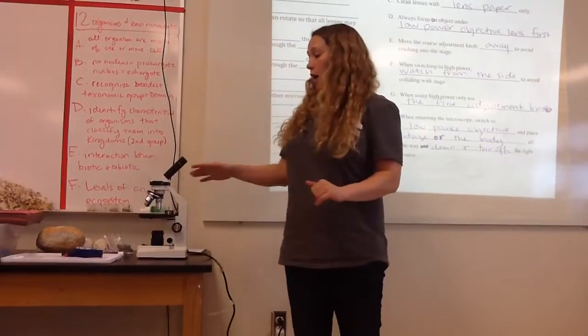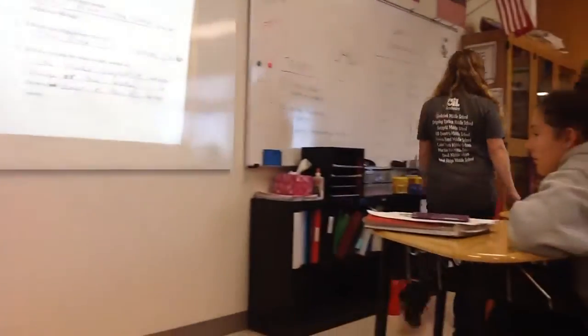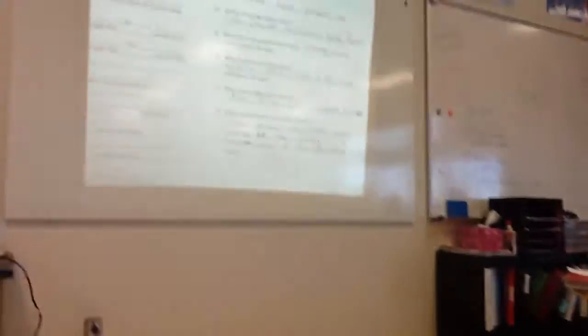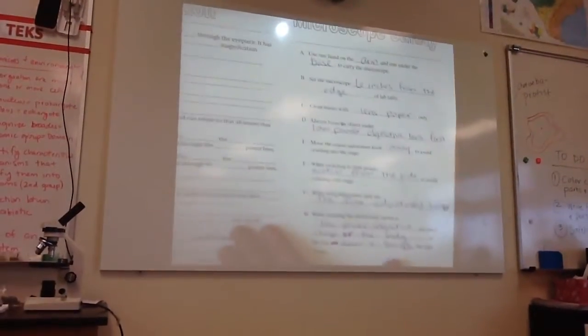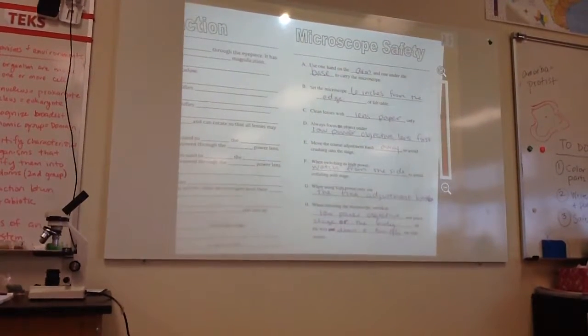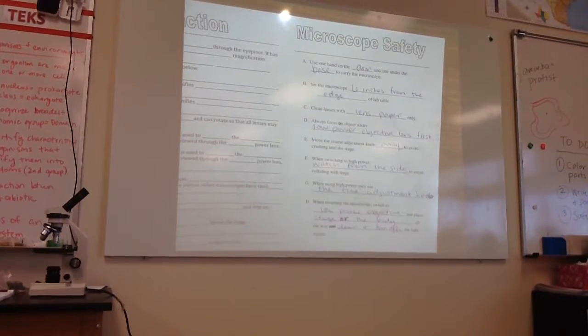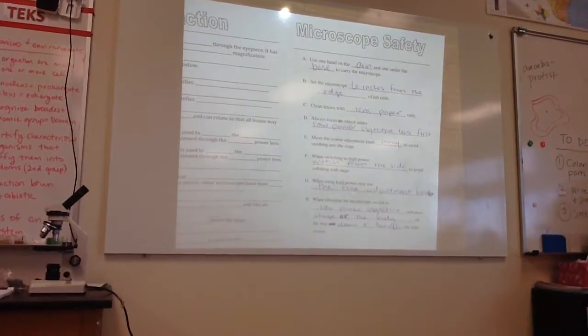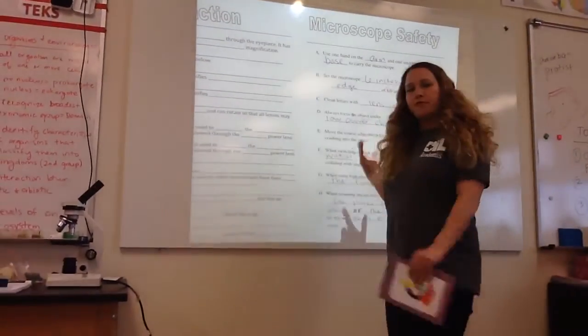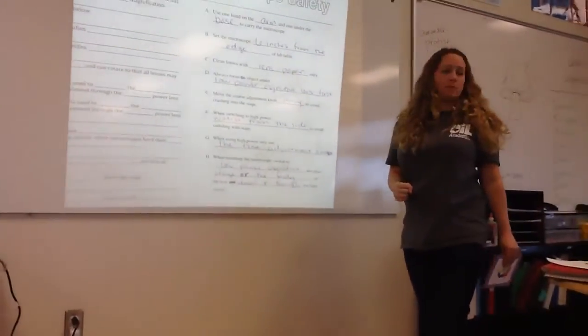Okay? So, I have put on the board the safety for this unit. I'm going to make it more in view for you. Let me get that ready. Back it up just a smidge. There you go. All right, so students, you can fill out your microscope safety information as we go. The answers are up here, and I'll be going over them and showing you how to use the microscope.